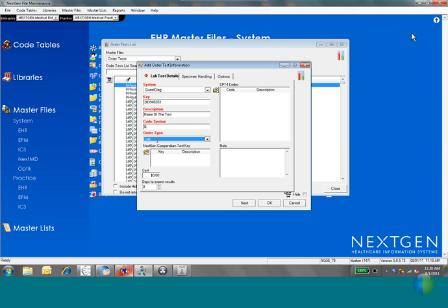So you have to have those. The rest of the information on this tab and the 2 other tabs is going to be optional, depending on the vendor and depending on what you choose to do with the system. So keep in mind, outside of these 5 required fields, everything else that you see in here, you may have to complete manually on your own. So loading in that compendium only takes care of these 5 required fields. The rest of the information is, like I said, situational. So I'm going to go through each one.